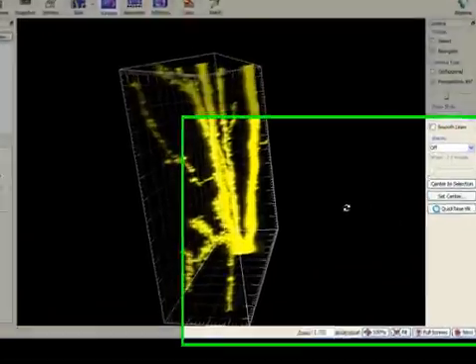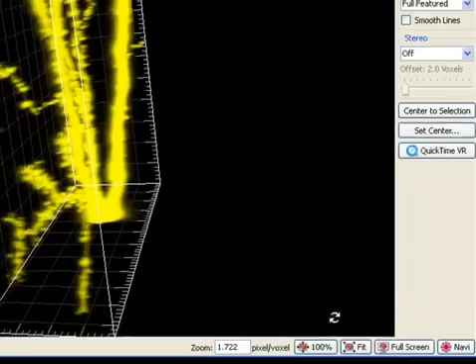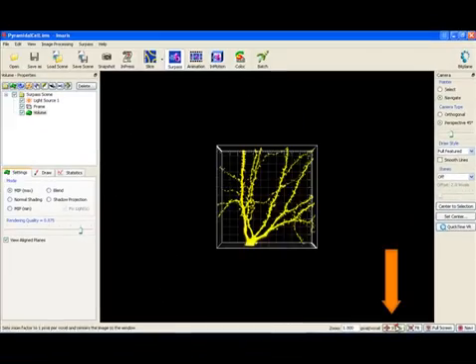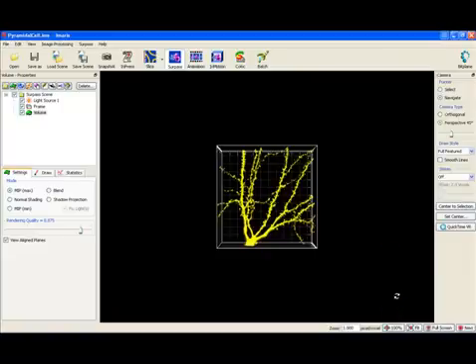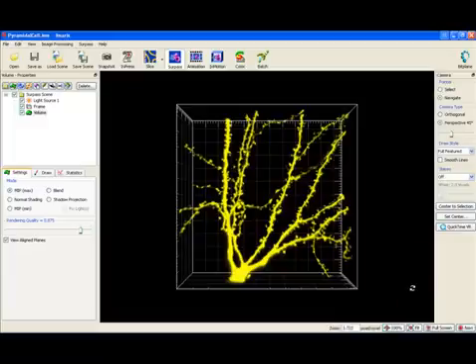There are two important buttons at the bottom of the screen: 100% and Fit. The 100% button rotates the image to the original position, centres it and sets the zoom factor to 1. The Fit button finds the image best fit in the view area.